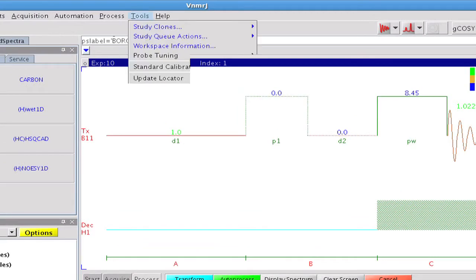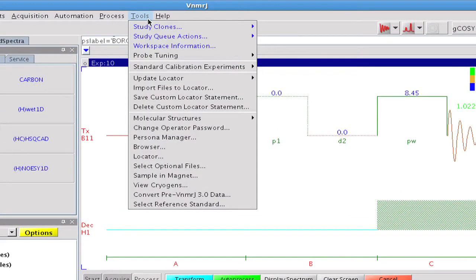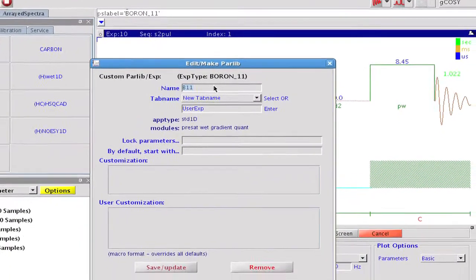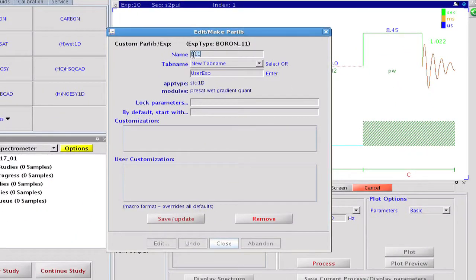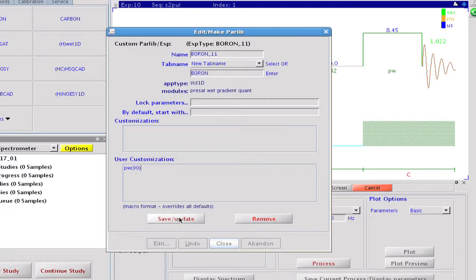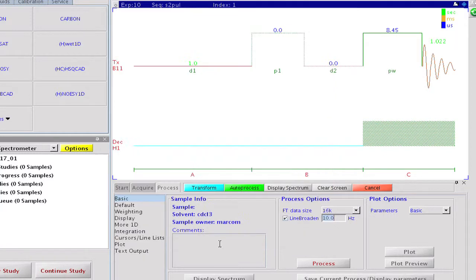When all the desired changes are complete, we save this file as the default protocol for B11. We can do that via the tools menu. The new protocol button will be labeled as boron 11 and we put it into a new experiment tab called boron. We may do further customization here if we wish. As an example, we choose a 90 degree observation pulse. We save the parameter set and close the panel.